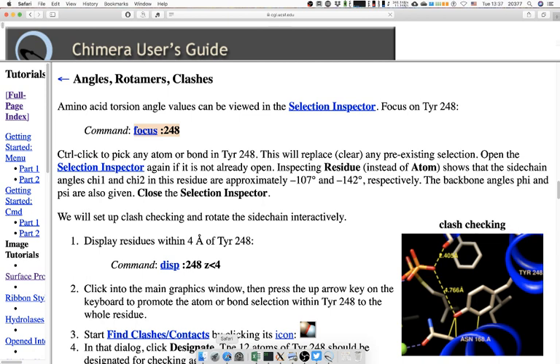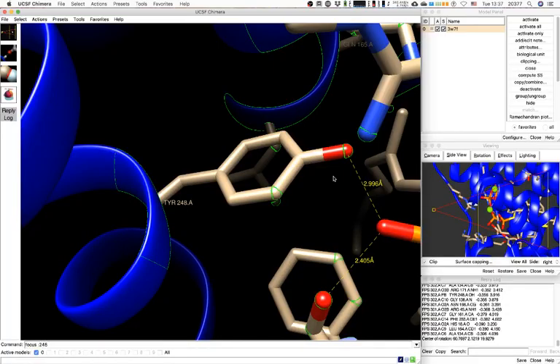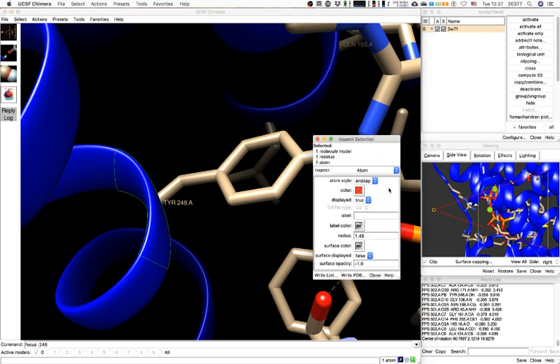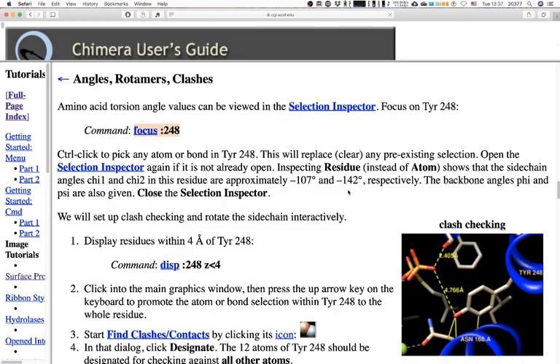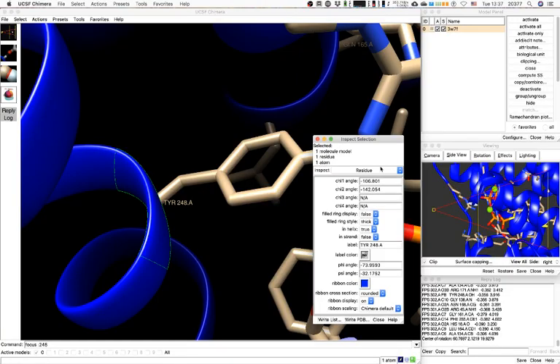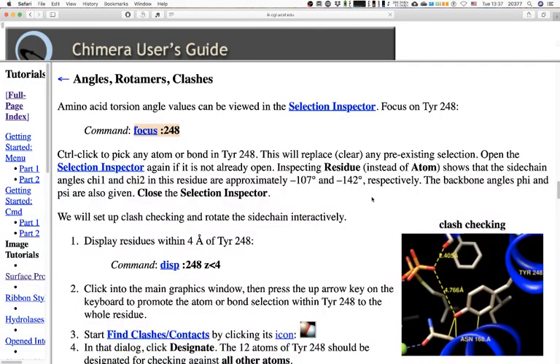Control-click to pick any atom or bond in the residue — this will replace any previous selection. Then open the Selection Inspector if it's not already open and set it to inspect residue. Change the display to residue mode. We have chi-1 angle of 106 and chi-2 of 142.